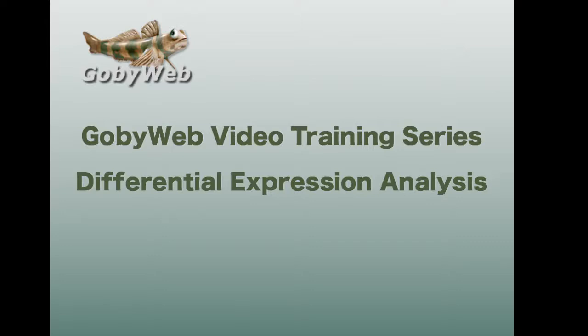In this tutorial, we will demonstrate how to carry out a differential expression analysis from RNA-seq data. For this tutorial, we will be using a publicly available dataset from GEO, the Gene Expression Omnibus, accession number GSE33141. In this study, wild-type mice retina were compared with neural retina-specific leucine zipper double knockout mice, NRL double knockouts. We have 3 biological replicates for each condition. These samples were previously aligned using GobyWeb, and we will now show how to carry out the differential expression analysis.